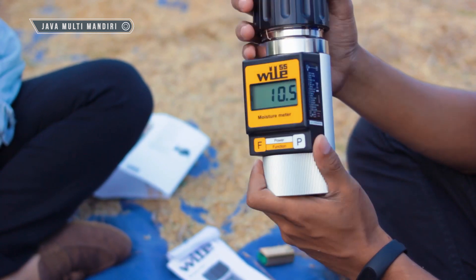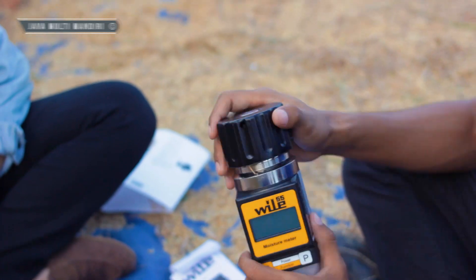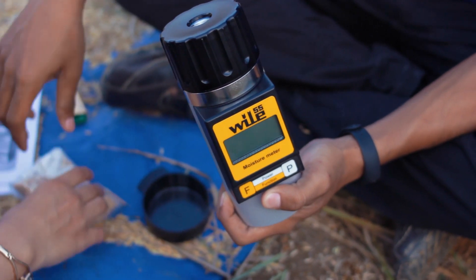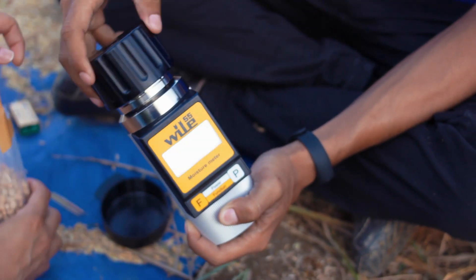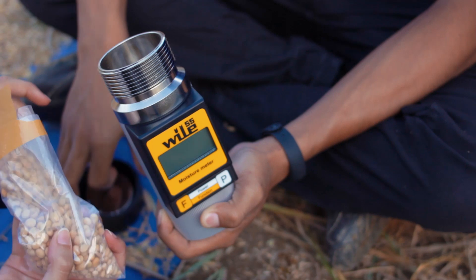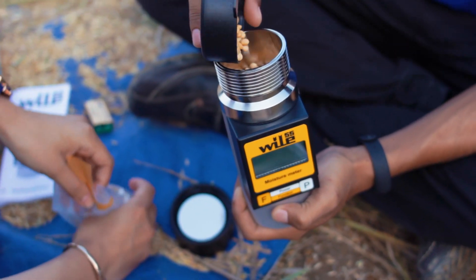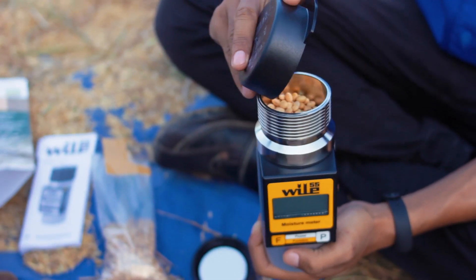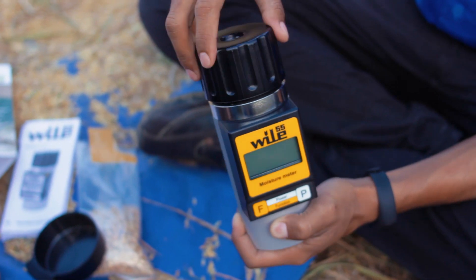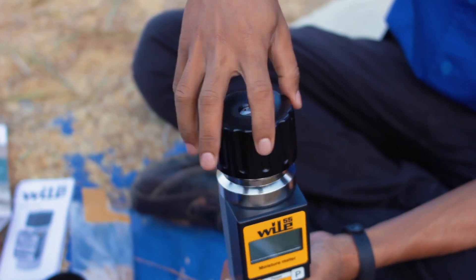Begitulah cara pengujian untuk biji gabah, dan nilai kadar airnya adalah 10,5%. Selanjutnya kita akan mengukur kadar air pada biji kedelai. Seperti biasa, kita masukkan dulu sampel pada titik ukur, satu per empat. Kemudian kita tutup kembali, lalu goyangkan alatnya. Kemudian kita masukkan sampel hingga penuh.